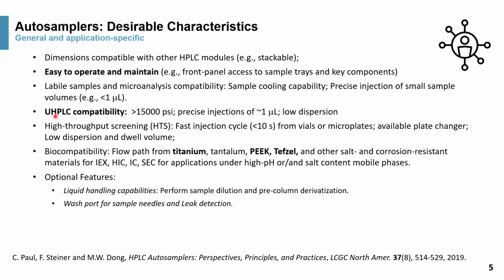UHPLC compatibility is important, obviously, for UHPLC systems, meaning that the injector has to withstand at least 15,000 psi and be able to precisely inject very small volumes, for QC application typically 1 microliter or less. It should also have low dispersion.